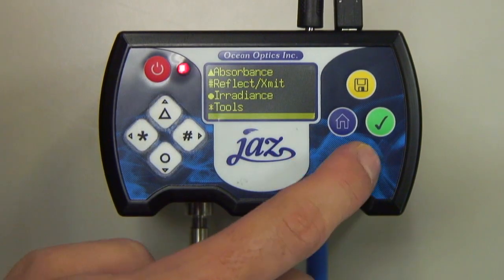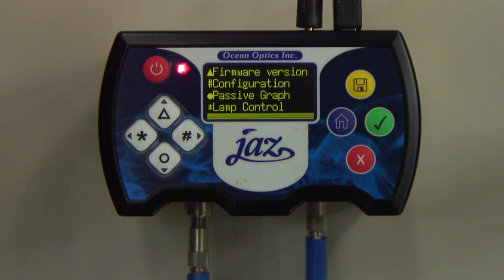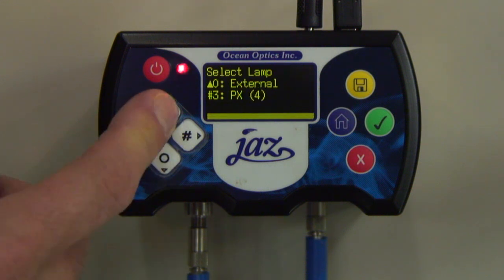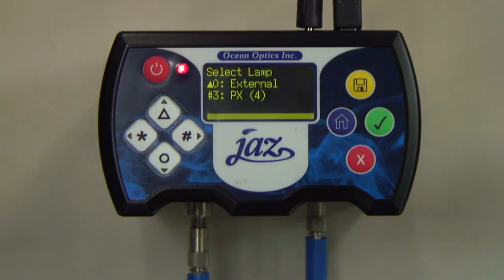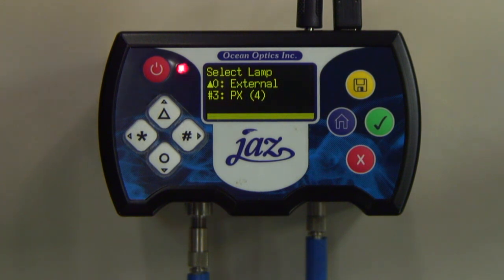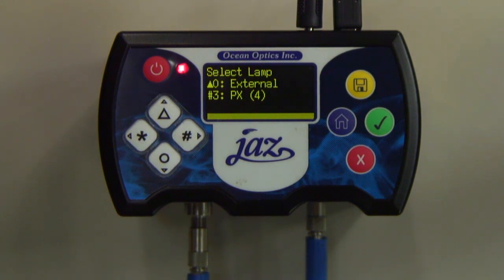Our final step is to return to the Spectrometer menu. Press the Star button to choose Lamp Control, and then press the Triangle button to choose the lamp. The Jazz will detect the PX module in the third module location, unless multiple spectrometers are included in your stack. This particular Jazz stack has only one spectrometer module, so we press Pound to choose the PX. We are now running the Jazz PX in Triggered Mode and ready to perform an experiment.